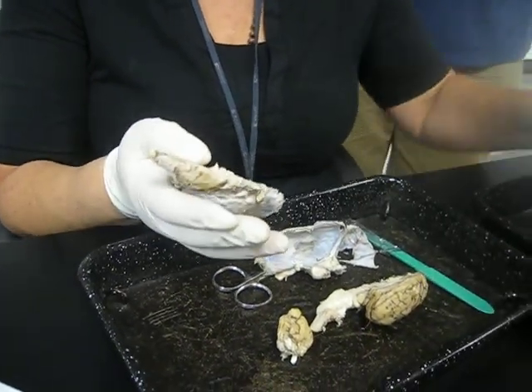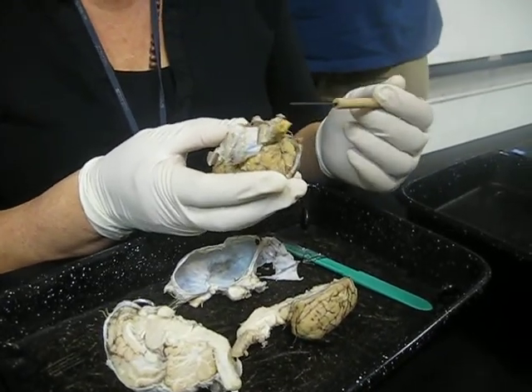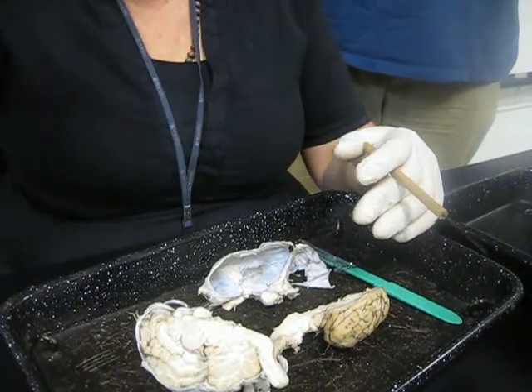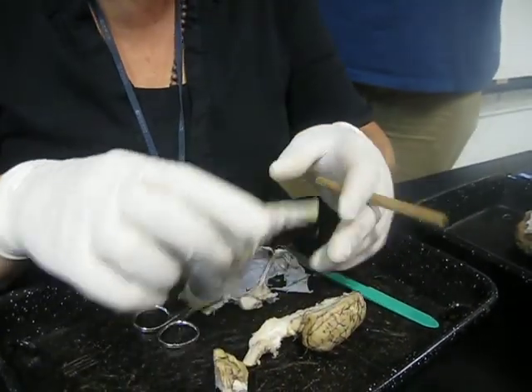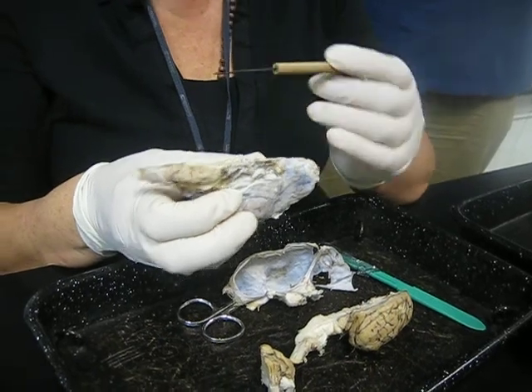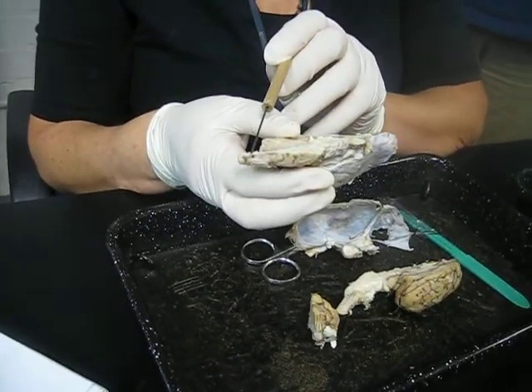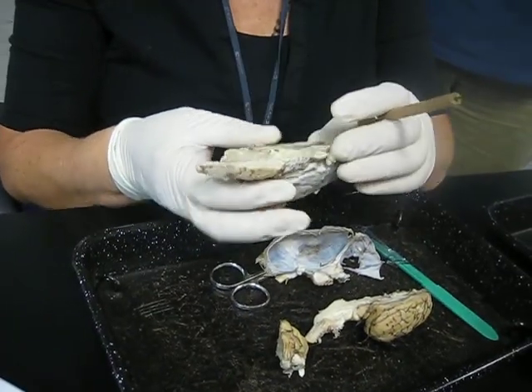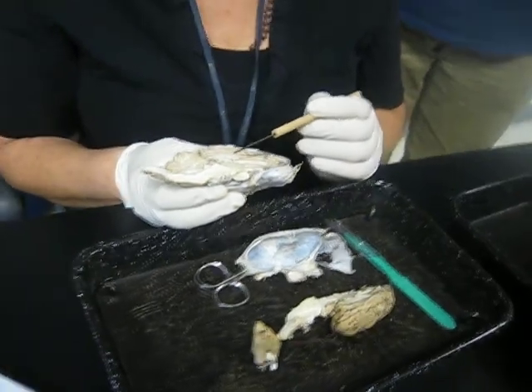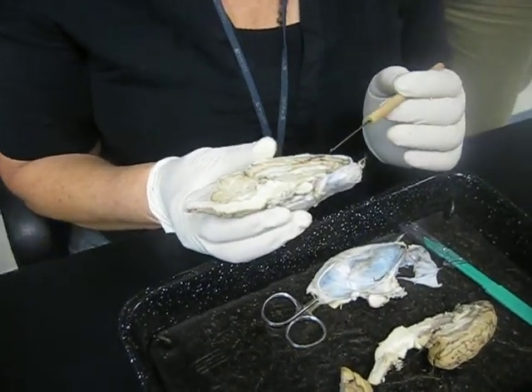Okay, remember here you can see it. Here you can see the pons and then the medulla. But because they walk on all fours, they kind of smudge all together, and so now you just count bumps. So if I pin here that first bump, you know that's the pons, and that's the medulla. This is the central canal of the spinal cord. Okay, here you can see the corpus callosum. This is the corpus callosum.